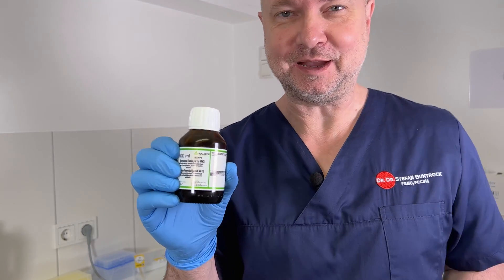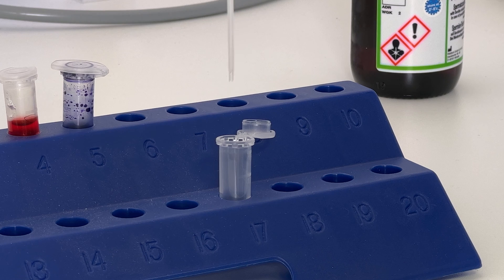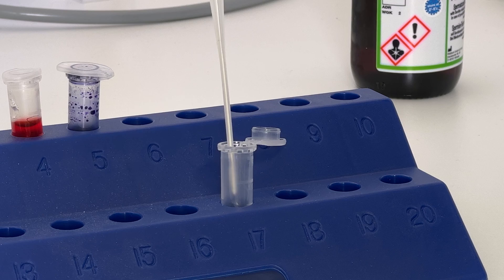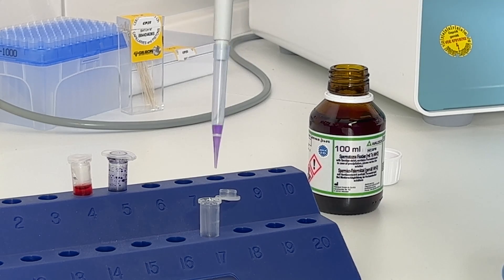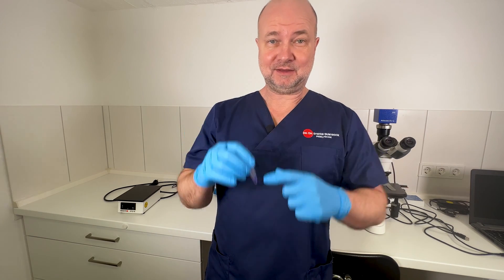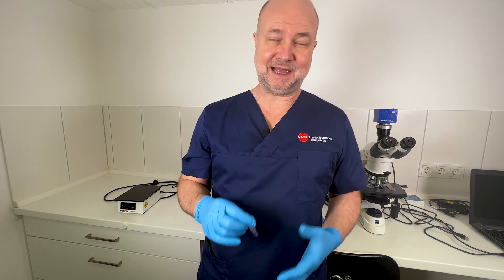I'm using a special kind of — in German we say 'puffer' — a buffer solution. It's called WHO buffer. I'm going to use a one-in-ten dilution, so 180 microliters of WHO buffer. I just vortexed the sample and swirled it around to distribute the sperm evenly, then added 20 microliters of sperm to the 180 microliters of WHO buffer. I can't stress this point enough — I have to mix the sample at all times to distribute the sperm evenly, because this is key for passing the exam.